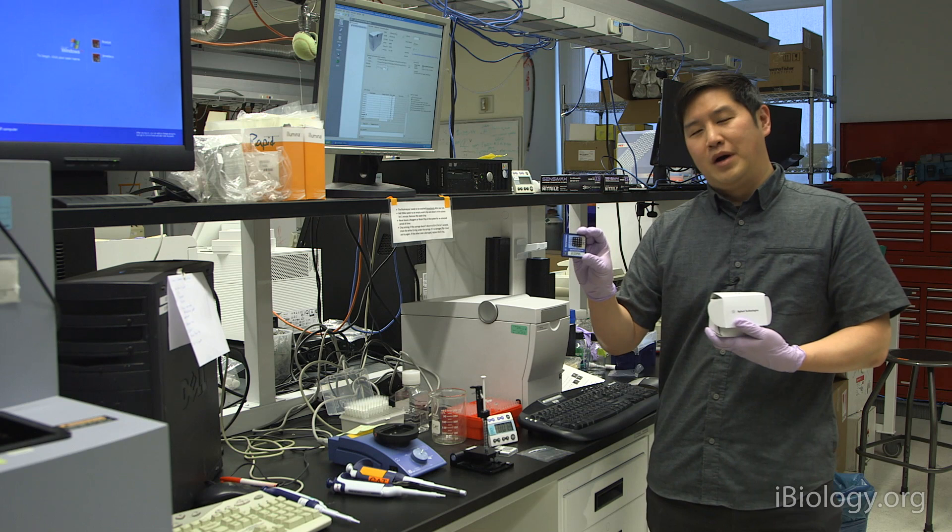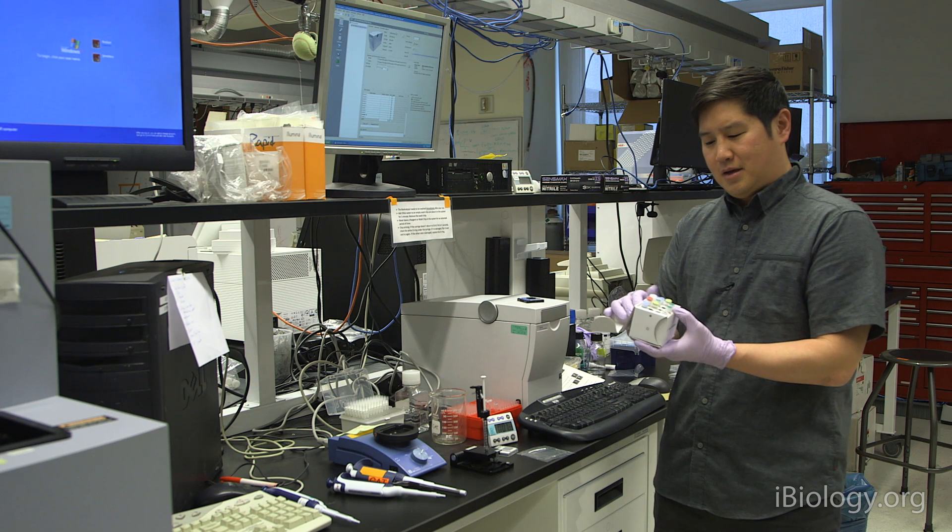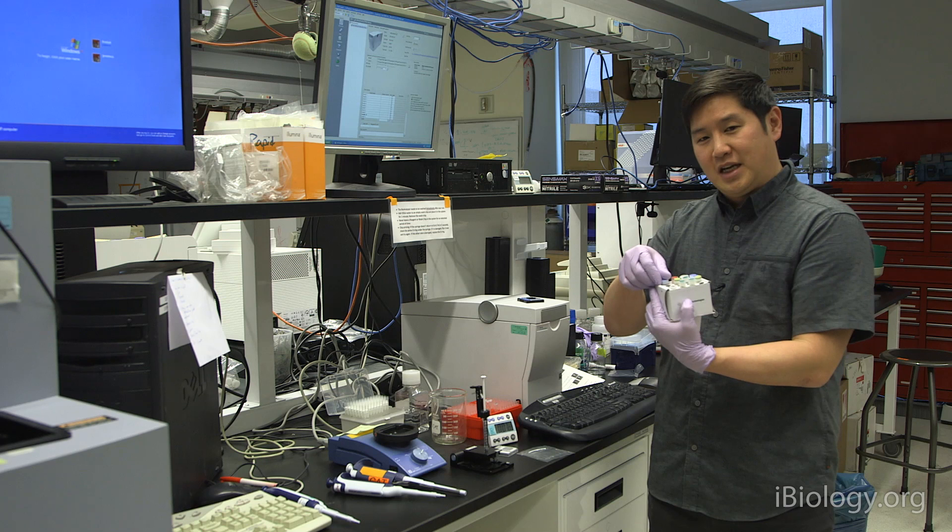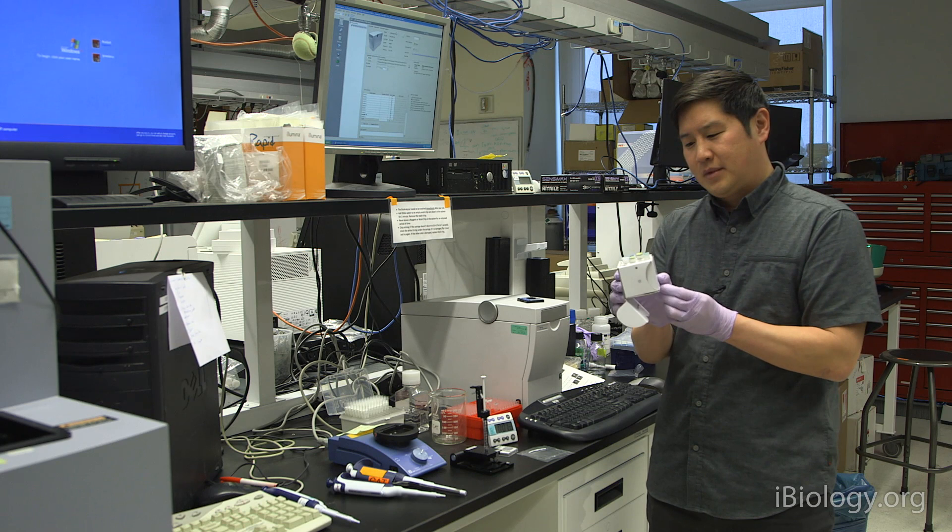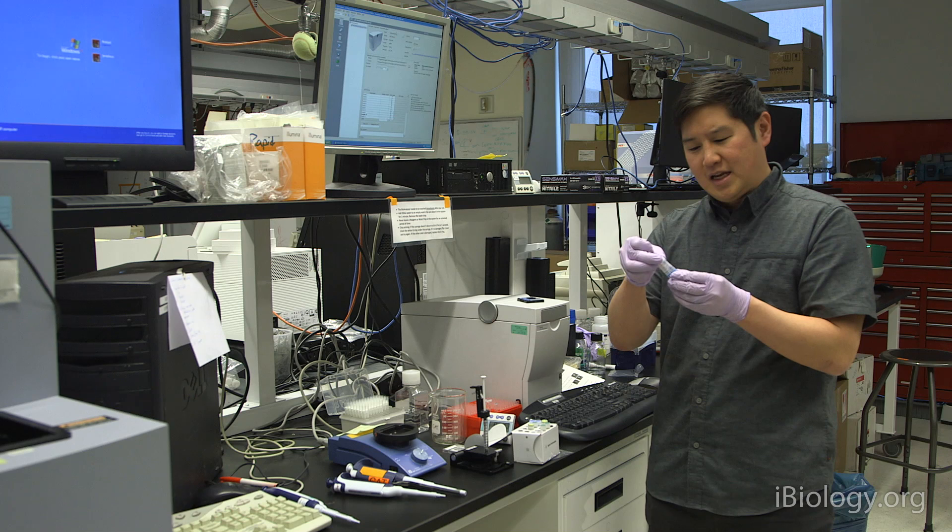All the reagents for the kits come in a small box like this that's kept in the cold room, and they all come with a pack of chips that are at room temperature. Once you open up this box, and today we're going to be going over the DNA high sensitivity kits, you'll see a set of reagents in here. The reagents that you'll need to prepare the gel dye mixture ahead of time are a dye, the gel, and a spin filter.